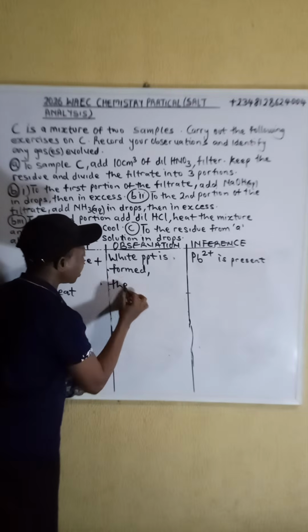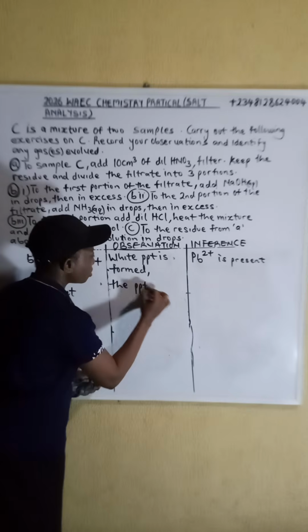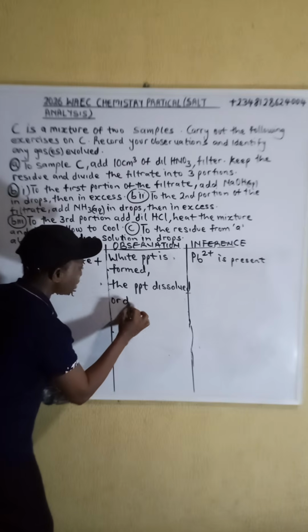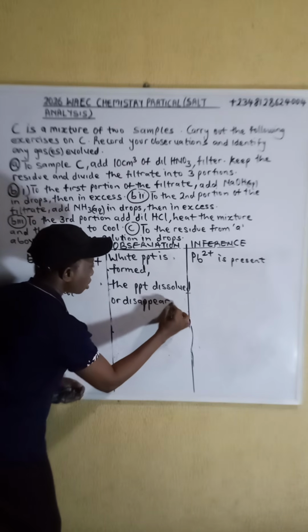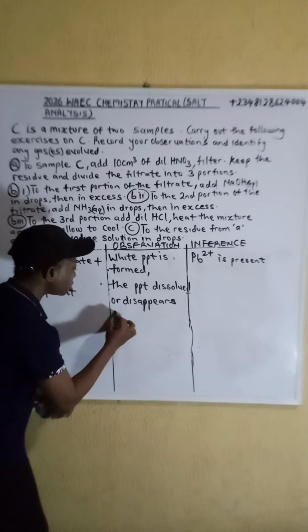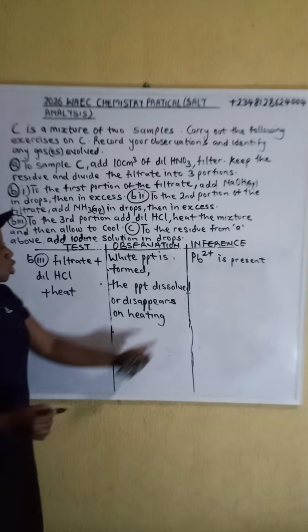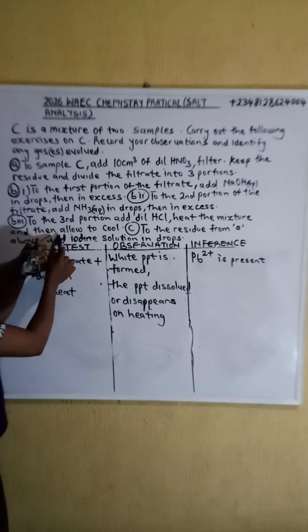The precipitate dissolves or disappears on heating. Then what is going to happen after cooling?